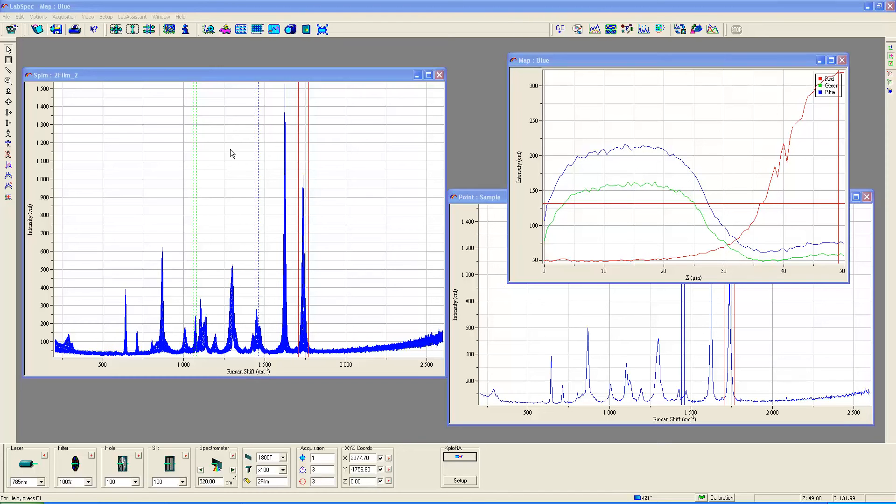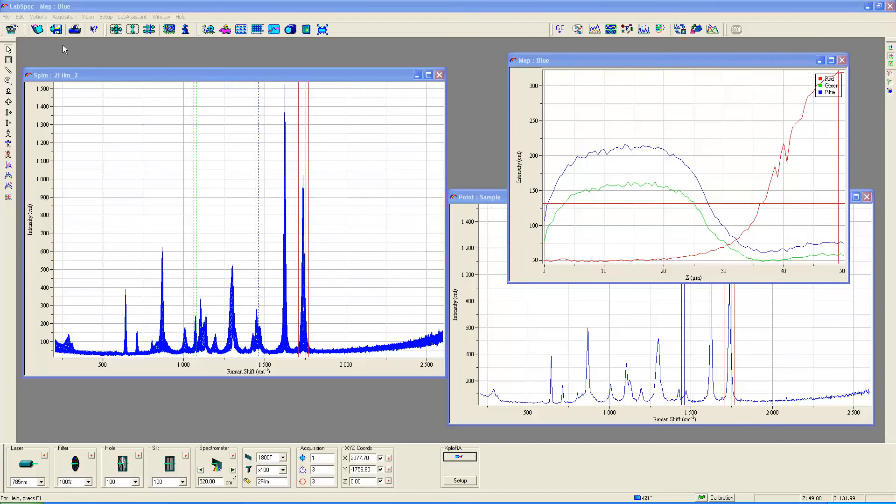Let's begin by describing the sample that I prepared and the spectra and the depth profile that you're seeing associated with it. This is essentially a homemade sample.